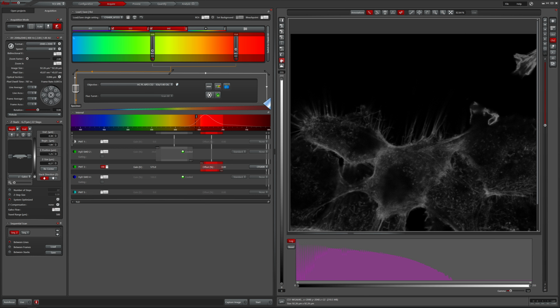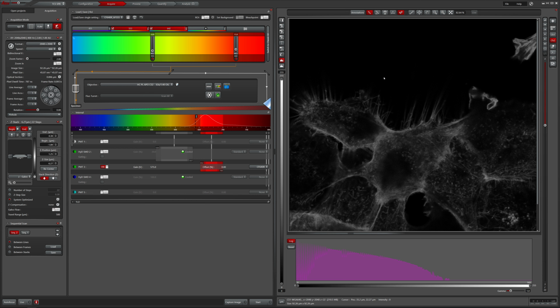We've already kind of covered the histogram. It'll show you for every pixel in here, right? Where does that lie?